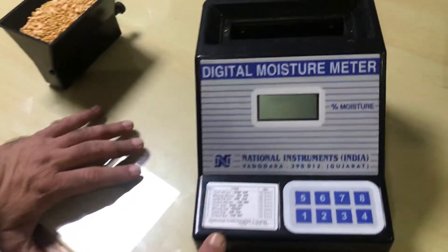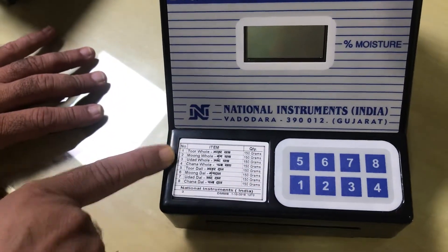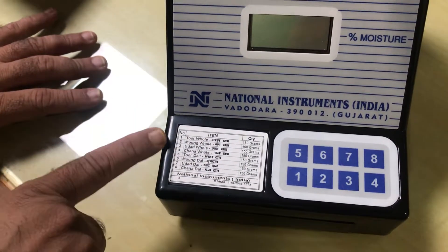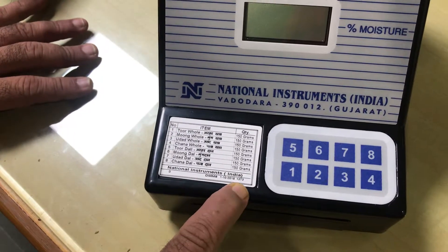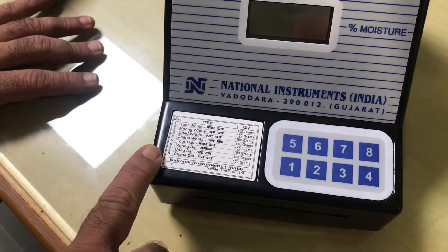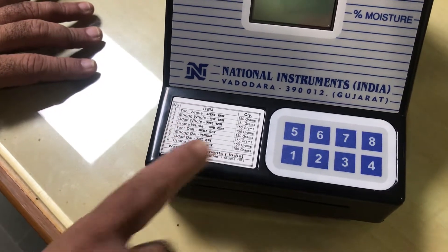Now we will demonstrate you to measure a percentage moisture in toor dha. You can see this is a National Moisture Meter. On this particular model, you can observe switch number 1 to 8, item name which is calibrated on the particular instruments and particular samples quantities to be taken. We are measuring toor dha — number 5 key is calibrated for toor dha, 150 grams.